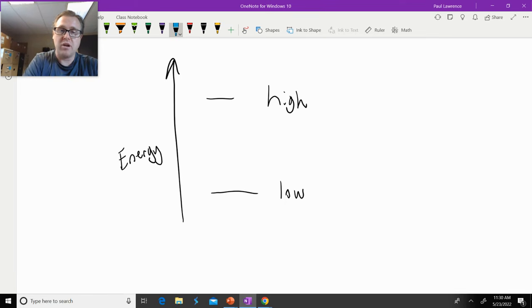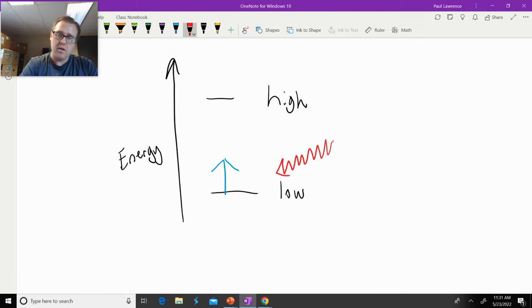Let's take a nucleus and place it, and that nucleus is in a low energy state. Let's zap it this way here. We cannot take a radio frequency photon, shine it onto the molecule, and promote it to the higher energy state. It does not work. And the reason why it doesn't work comes down to this concept of spin states.